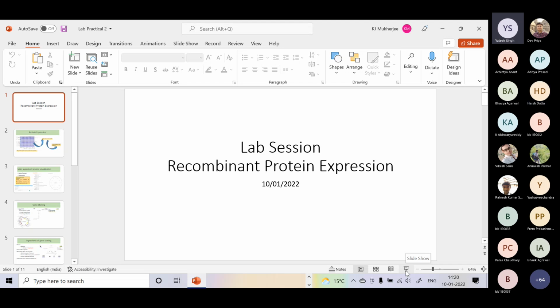Sorry, can you repeat that once again? I didn't get it. We just learned about a gene runner where we can design primers. Okay, so you are not familiar with others. Sir, I can name one. Sir, EMBOSS. Yeah, EMBOSS, what do you use? We use the EMBOSS Needle for BLAST, right?